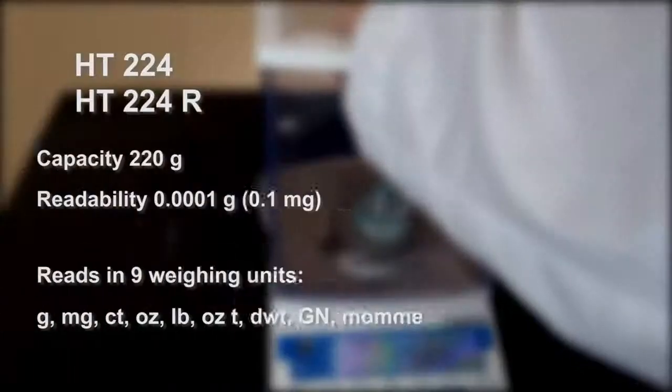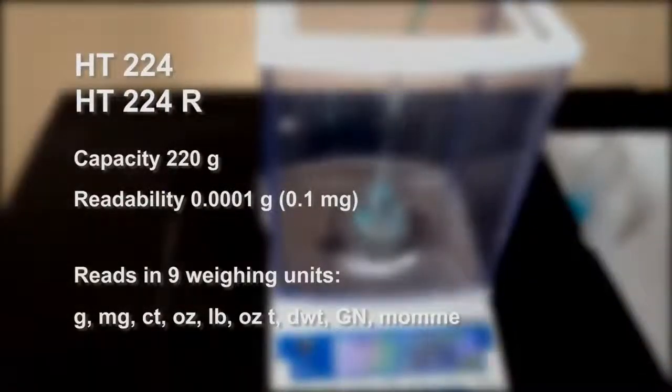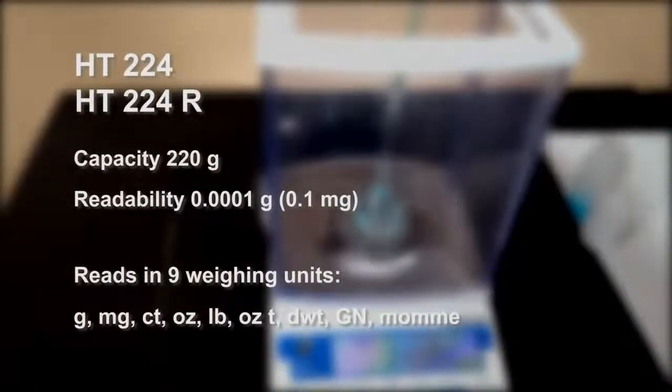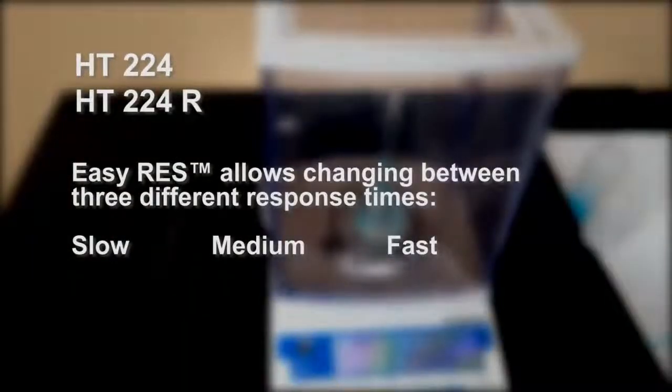The HT224 and the HT224R provide analytical weighing at 0.1 milligrams and read in 9 weighing units. EasyRes allows you to change between three response times to suit your application.